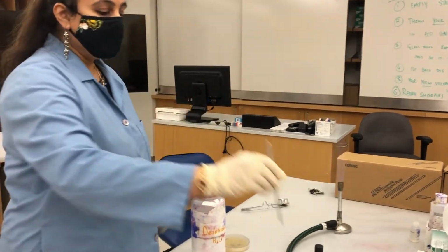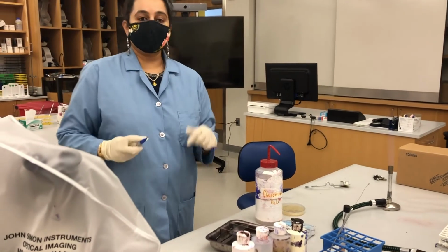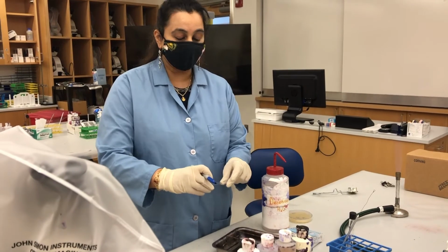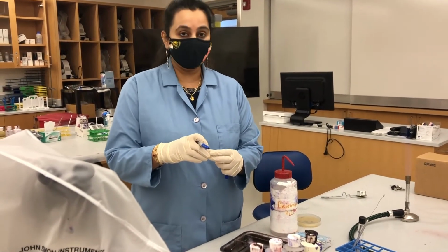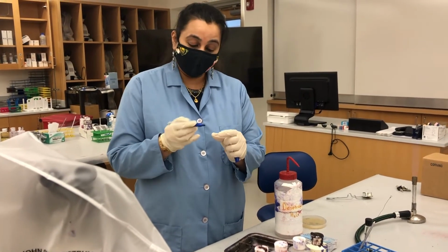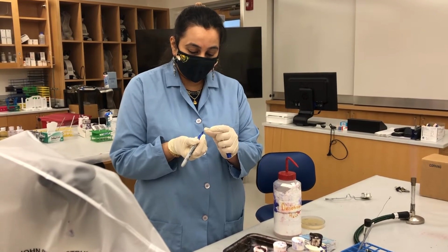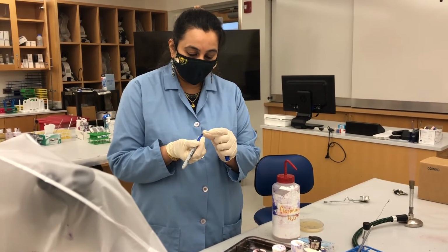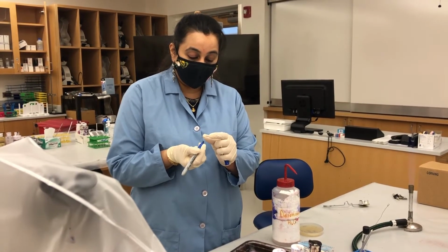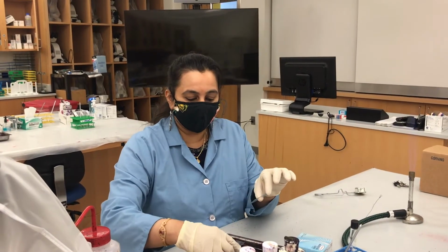Put it here and labeling the slide. So this is important, but at the same time, throughout your gram staining technique, it's really important for you to focus on what side you are adding the cells. I might have a label here, so what I usually do is put a marking on the other side, not on the side where I have my cells. So I labeled both my slides.